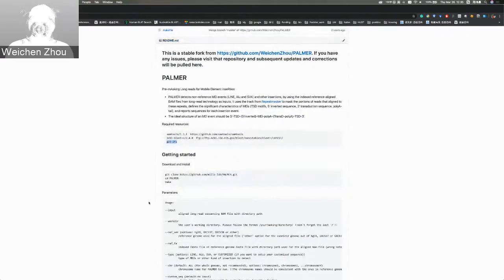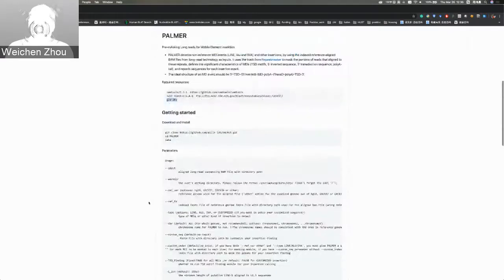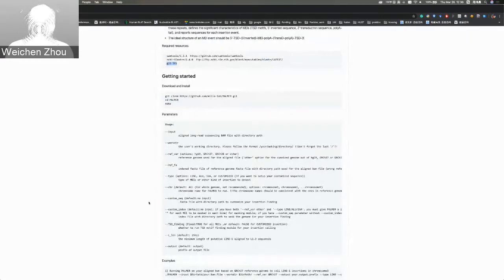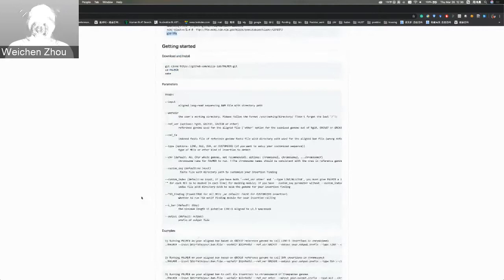To get started, you can simply download the Palmer package from GitHub using git clone. After downloading, you can go into the Palmer directory and simply type 'make' — M-A-K-E — and you're all done and can then use Palmer, if there are no errors.